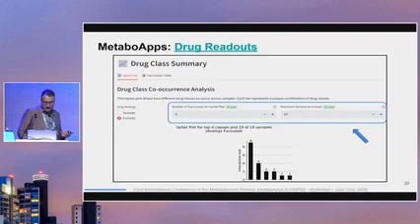And also we have the co-occurrence analysis, which by default is excluding the analogs, not showing them. For this data set, we have 4 top classes for the upset plot. And in this case, we are showing all the samples, just a small data set because it's easier for the server to populate as we are doing all these steps right now.